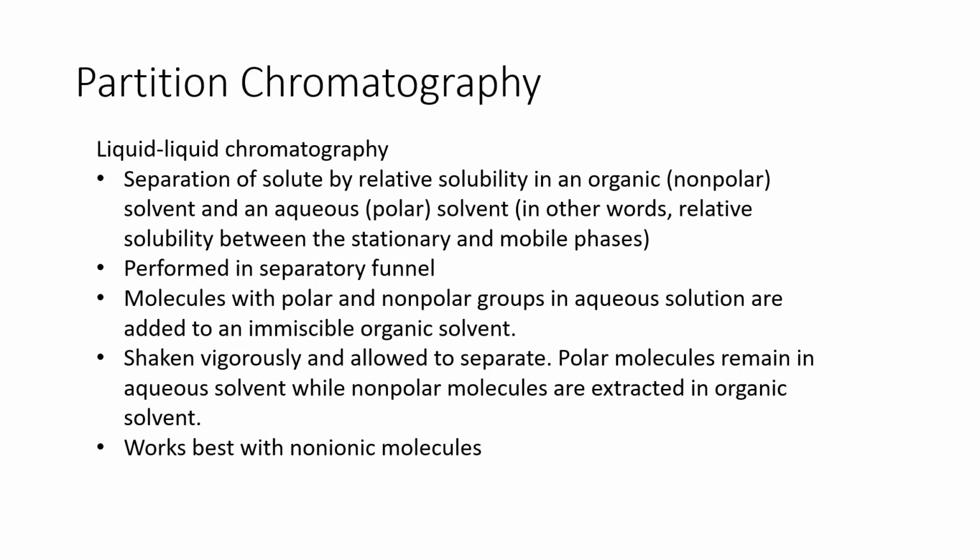Partition chromatography is also known as liquid-liquid chromatography because the stationary phase is a liquid instead of a solid, as you would see in adsorption chromatography. The separation of solute is by relative solubility in an organic or nonpolar solvent and an aqueous polar solvent. In other words, the relative solubility between the stationary and mobile phases leads to the separation.